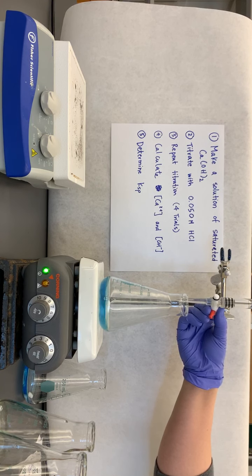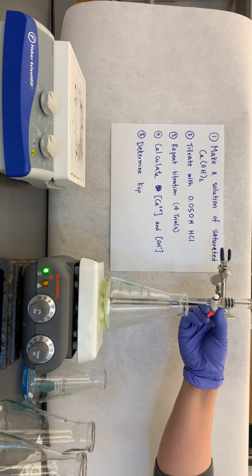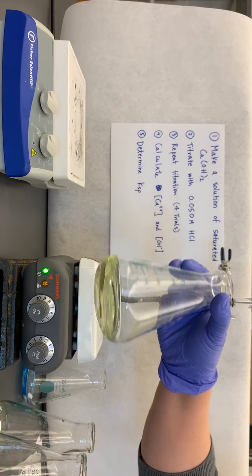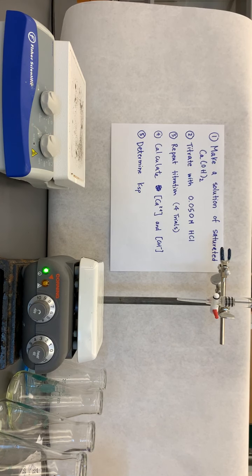Oh, almost there. Maybe one more drop. That looks good. Okay. And again, we're looking for this yellowish color, which you should see here. Okay. This is trial number 3, and that took up 3 points. Oh, not tall enough. Let me look at it again.